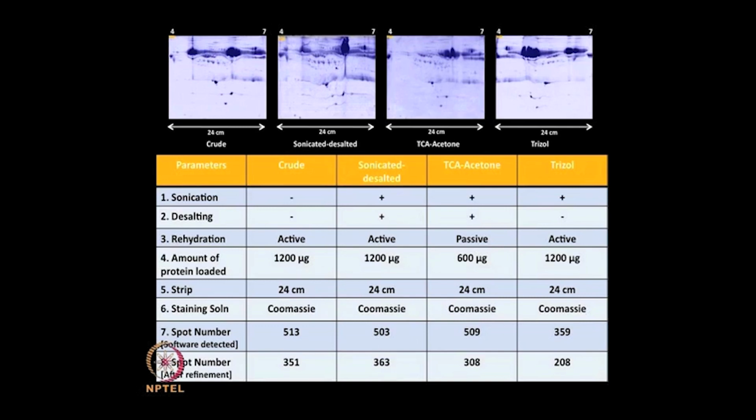I am trying to give you all the details of what one needs to actually perform before reaching the stage where you can compare the healthy control with the clinical samples. This lecture is trying to cover various concepts which we have talked about in sample processing and in different lectures of two-dimensional electrophoresis.